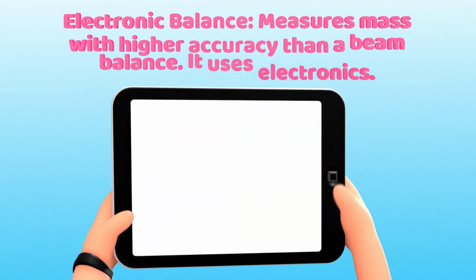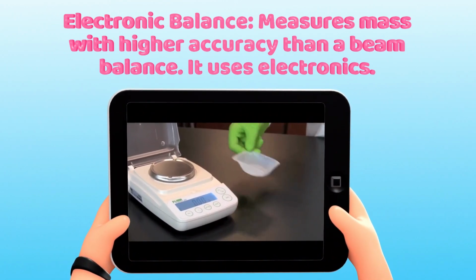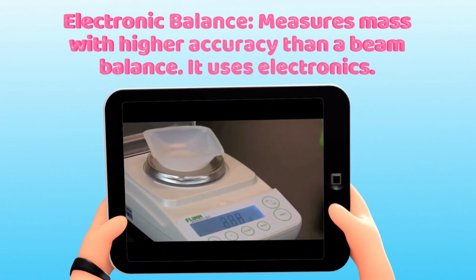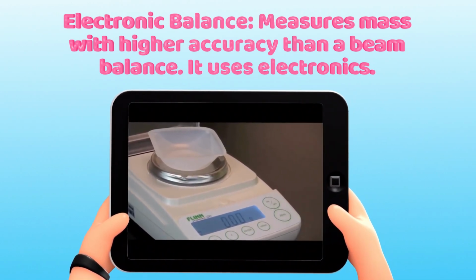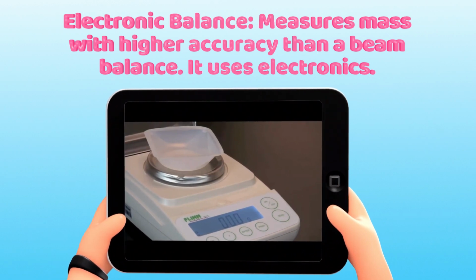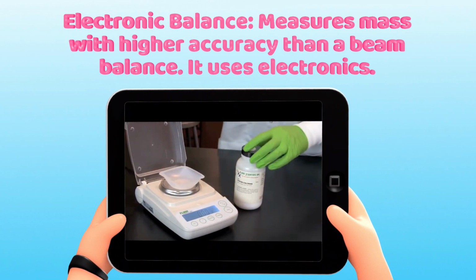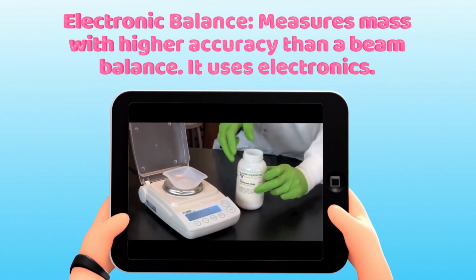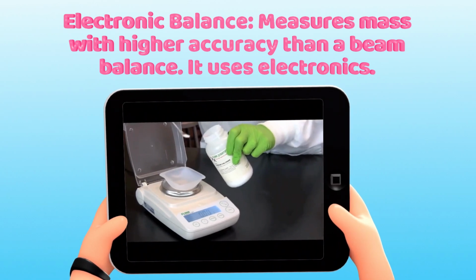Okay, let's now see the electronic balance. This measures mass with higher accuracy than a beam balance. It is because it uses electronics. First, you need to switch it on, and then you put the object on the measuring plate.